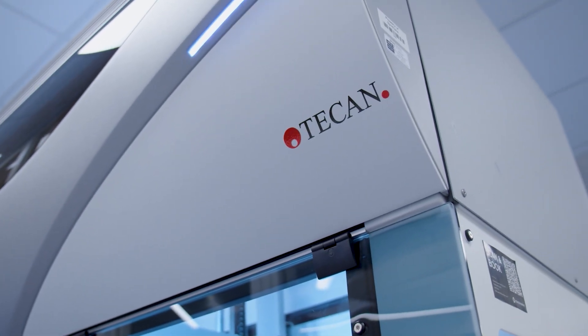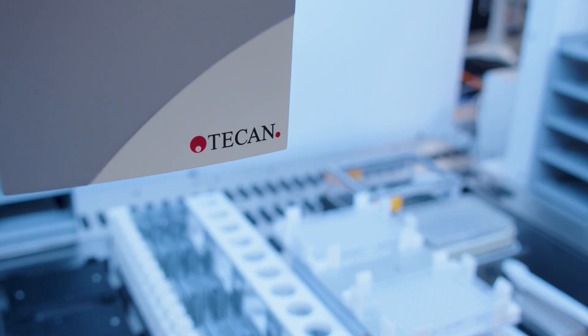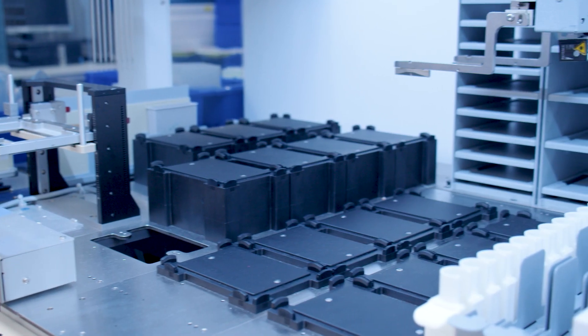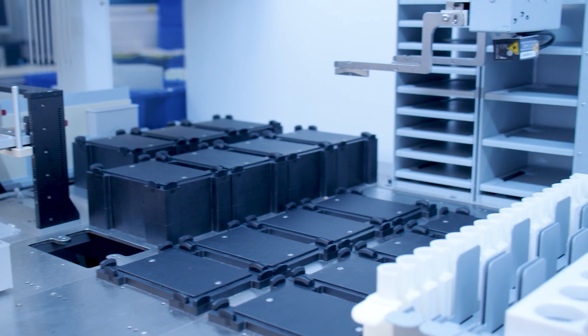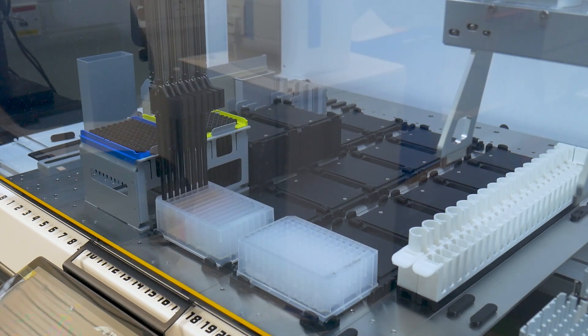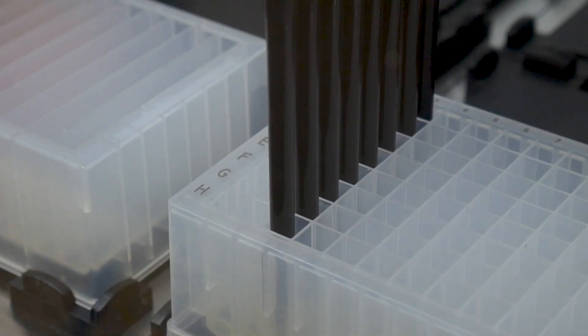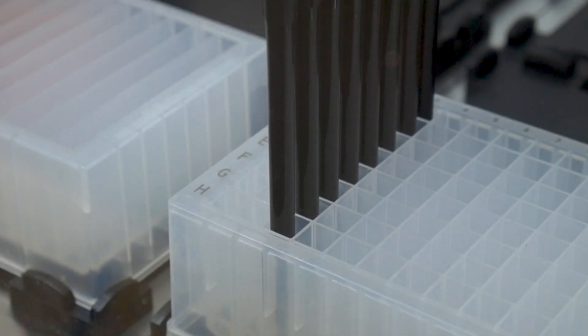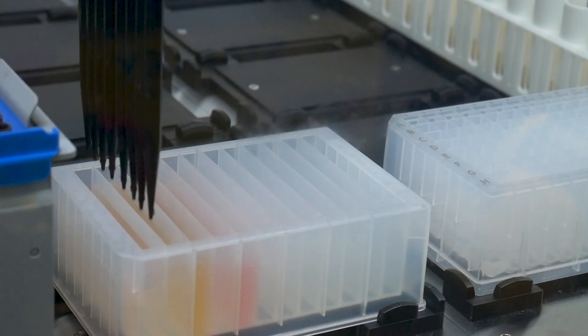The T-Can Fluent is a flexible and efficient liquid handler. Its modular design makes it versatile but it's particularly useful for genomics and drug discovery.